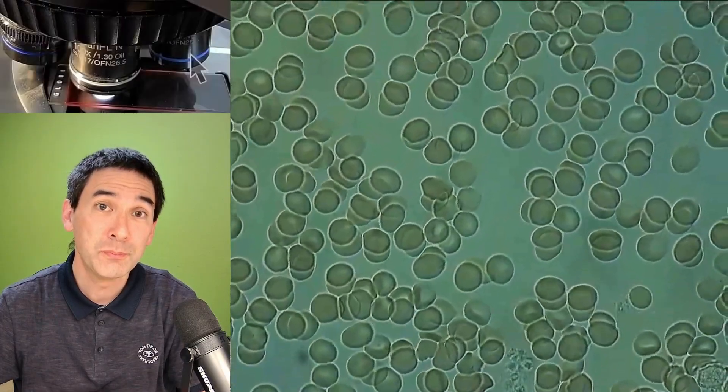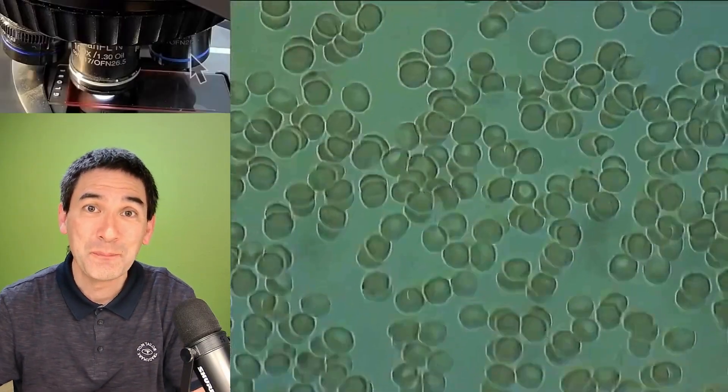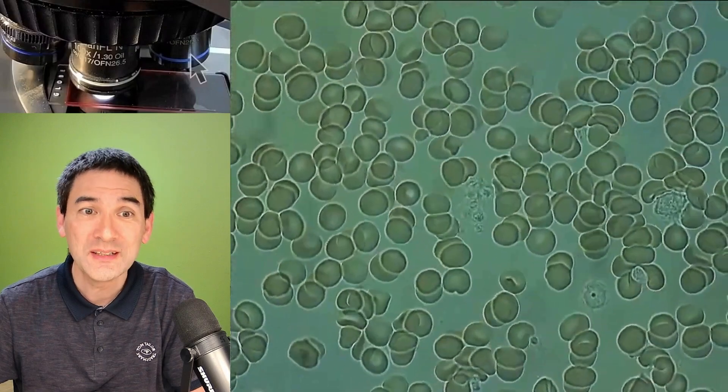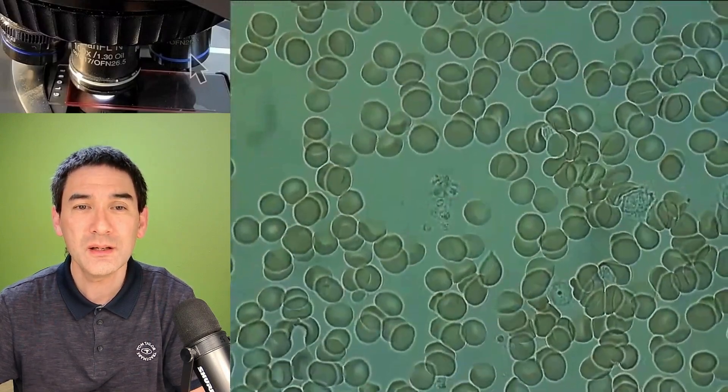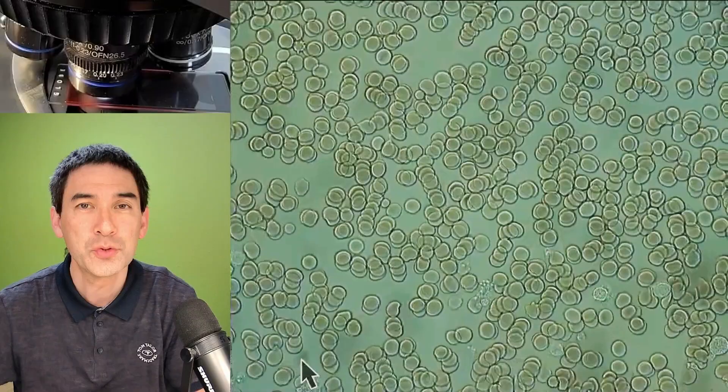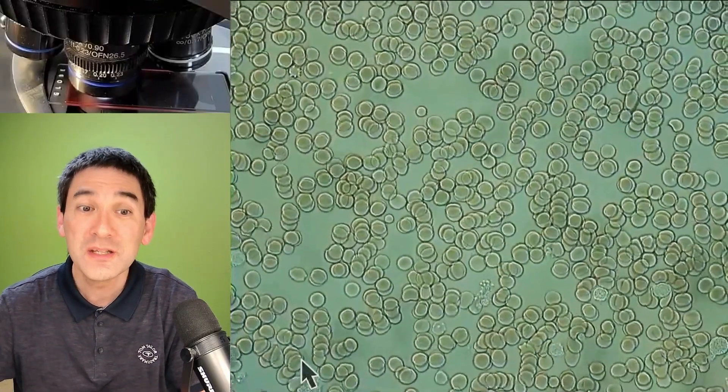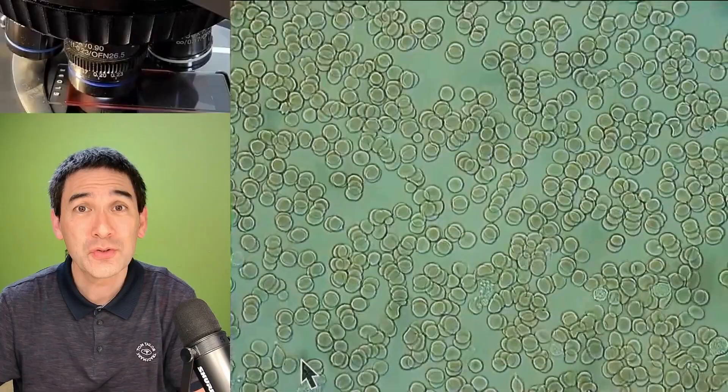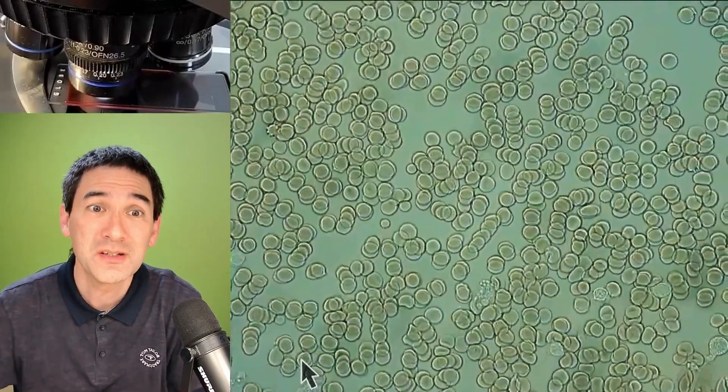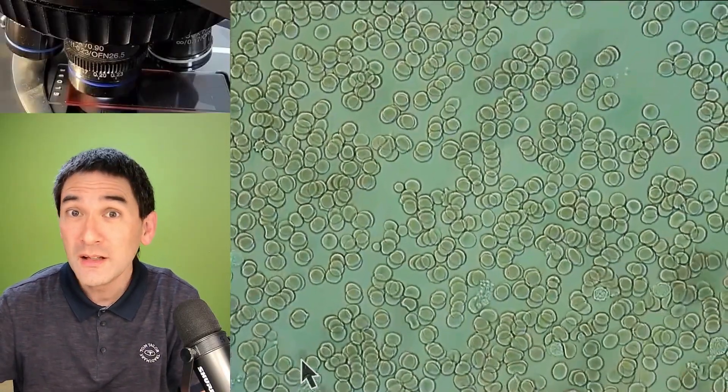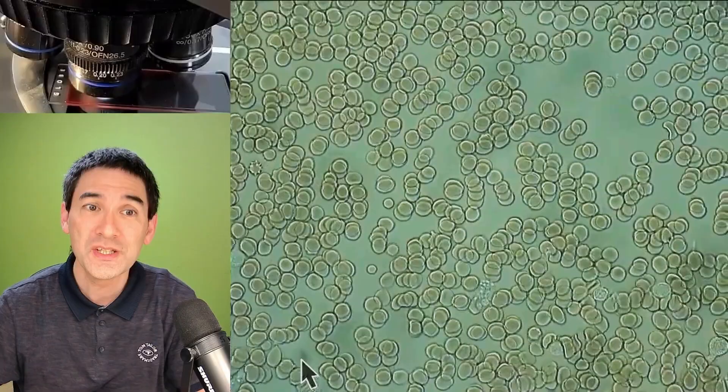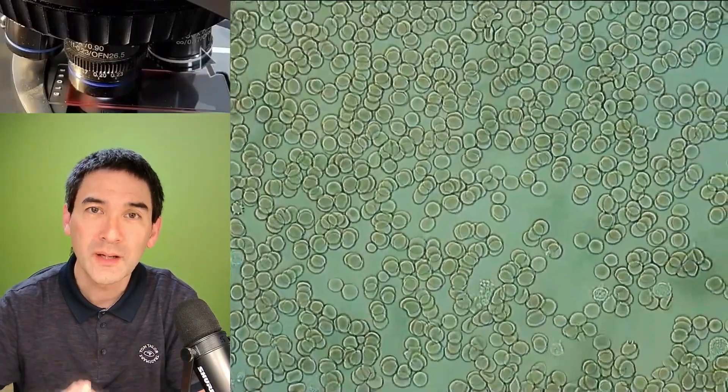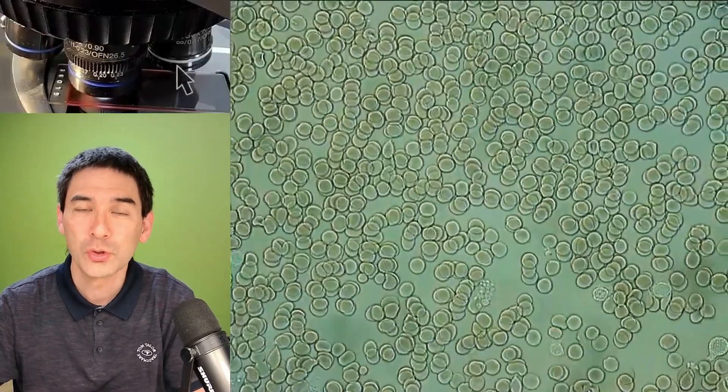Now it is also possible to change the imaging techniques here so I switched around using different contrasting techniques and you can also see that in some cases there seem to be some kind of obstructions in the way. Sometimes these are indeed white blood cells, it can also be dust and dirt that is on the microscope slide and you can actually see how the red blood cells are moving around that and if you wait a little bit longer then you can also see how the blood starts to dry up and how the blood cells start to stack up but right now here that's pretty much their normal shape.